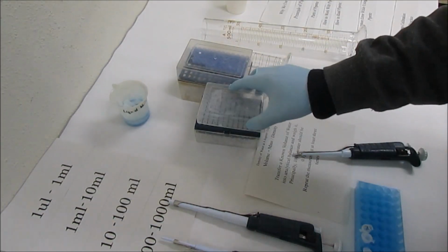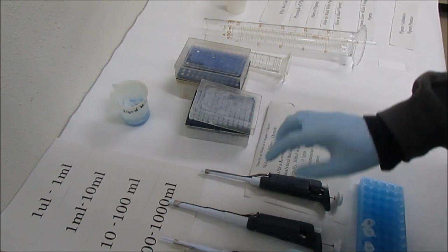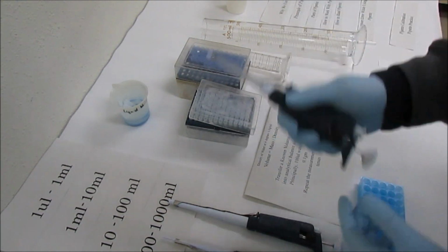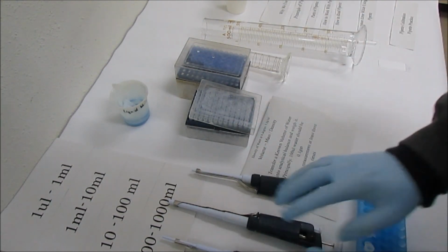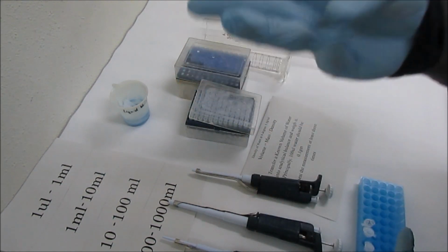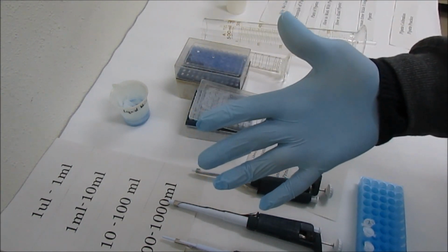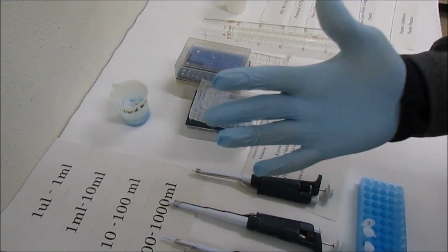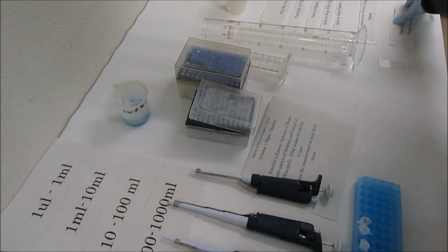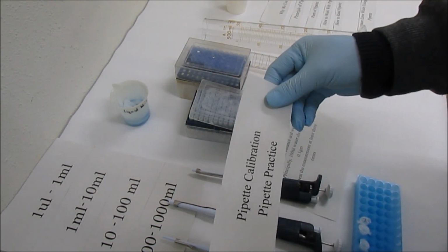So, a quick overview. What are the common errors? First is reading the pipettes, when you get an error in reading. Second, the selection of the pipette is very important. Third is correctly using the plunger. Fourth is aspirating the liquid properly, and fifth is expelling the liquid properly. These are the 5 things that you need to take care of all the time. The last one is pipette calibration and pipette practice.